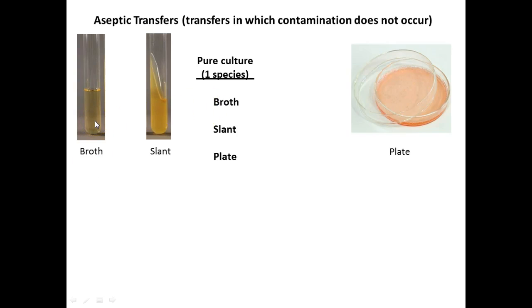Some of the organisms we work with are motile, which is great. They can swim around in a broth, right? And hence why that one that's really cloudy all throughout has a motile organism in there. It's swimming all around. And there's a non-motile one in there as well, hence the clump at the bottom, or dead ones that have fallen to the bottom too.